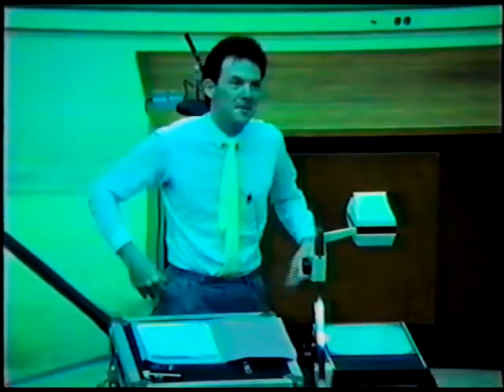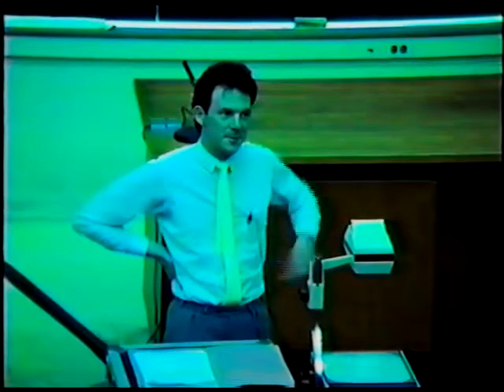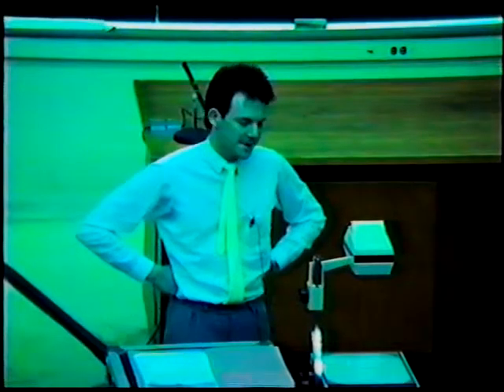My talk is going to be rather more qualitative than the last talk. We've used pulse field gradient NMR techniques to look at self-diffusion in zeolites. And this is a new venture for us. We've used these methods to look at polymer solutions and at the solid gas interface where the solid substrate is impermeable. So this is our first venture into this, and these are very new results.